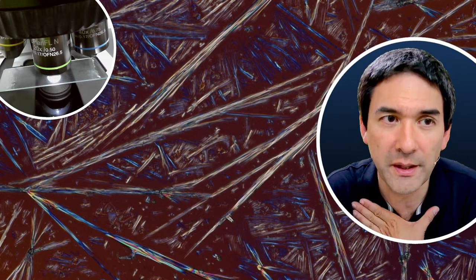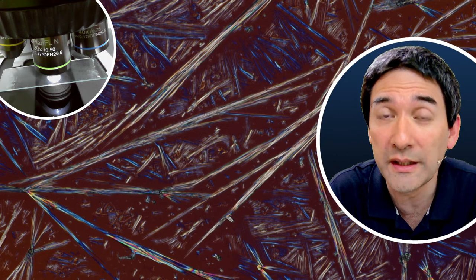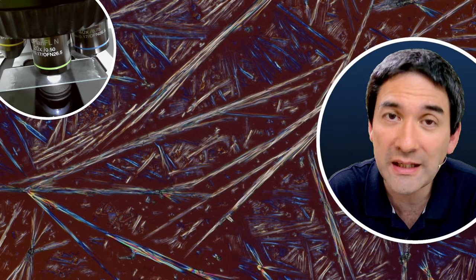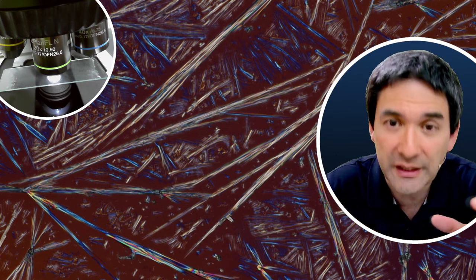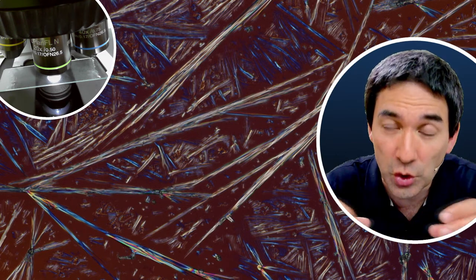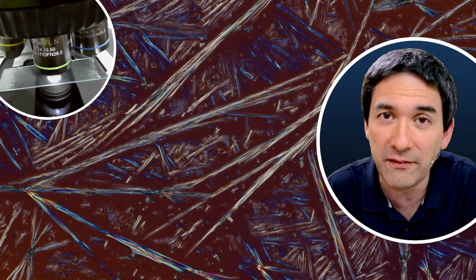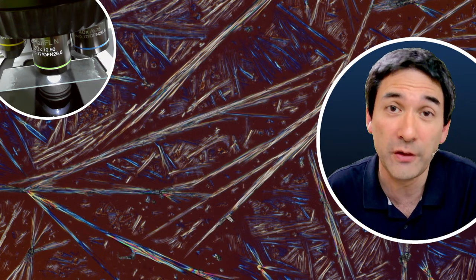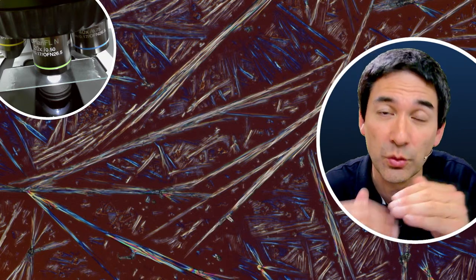What I have done as well, especially with vitamin C, which does not dissolve very well in alcohol but dissolves well in water, is I've used an alcohol water mixture, so that the alcohol makes the liquid spread very nicely over the slide, because it breaks the surface tension, and the water is able to dissolve the vitamin C very well. So even that is something I've tried out. In the past, I got very ugly looking crystals if I used too much vitamin C, for example, if it's too thick.